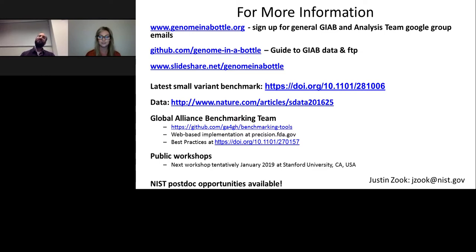And then these are also really useful for phasing variants, and it looks like they're going to be really useful for characterizing variants in difficult to map regions as well. Though that's sort of an ongoing process, since these reads do have a higher error rate in general, and so characterizing small variants with them is taking a substantial amount of methods development to use them in that way.